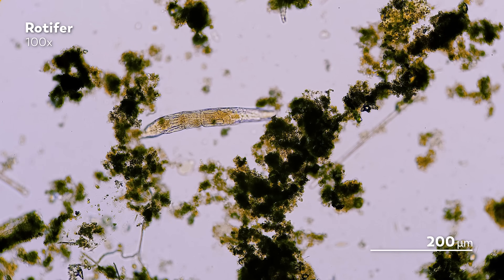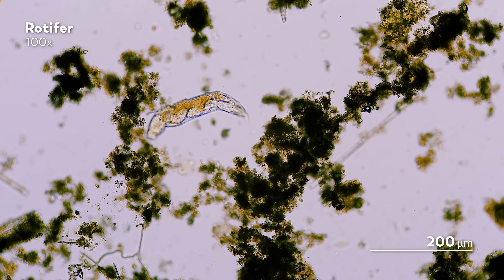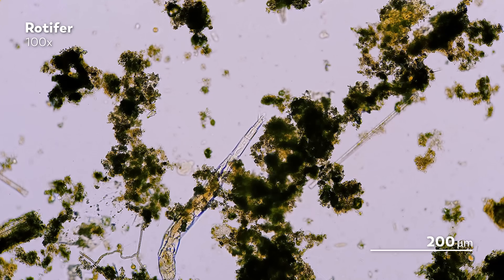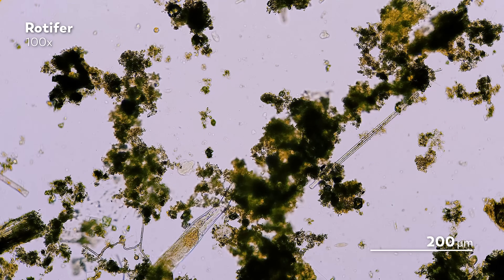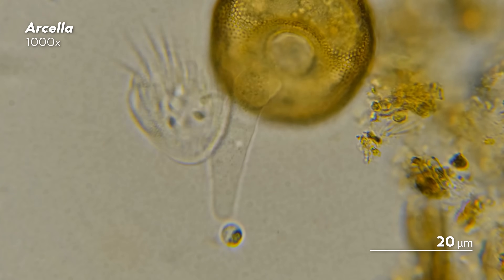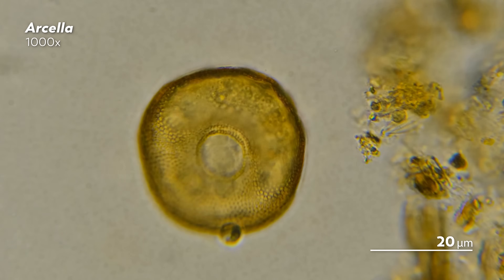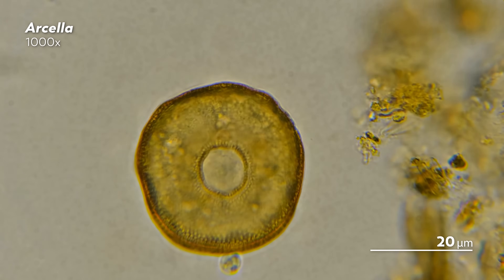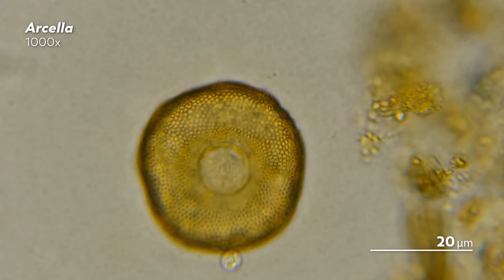Now there are times when that light might shine a little too bright and drown out some things we might want to see, so in the future we might cover some other filters and techniques. Now once you have your microscope set up, the next step is to decide what part of the microcosmos you want to explore. And the good news is, the microcosmos is just about everywhere.